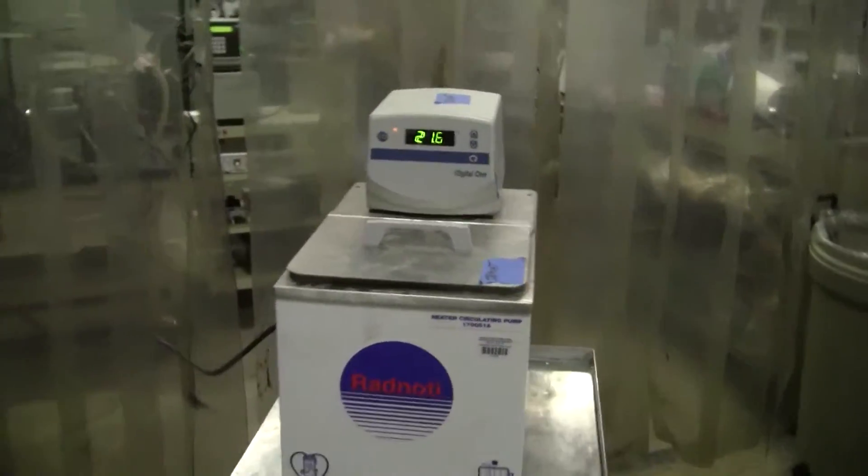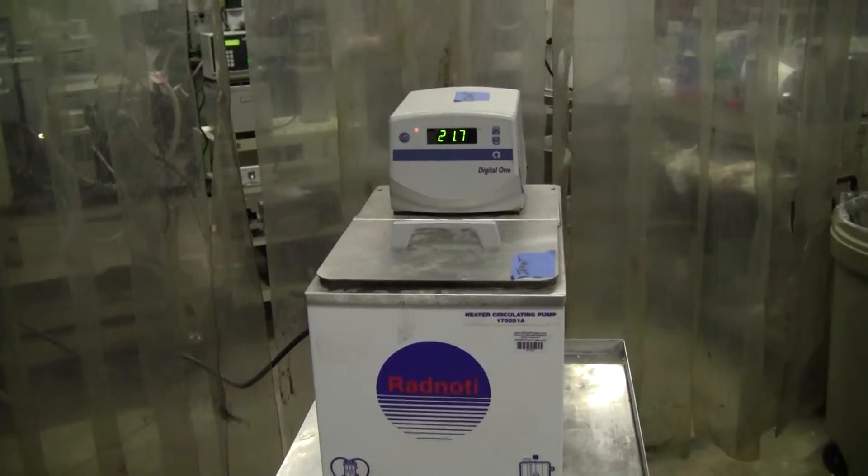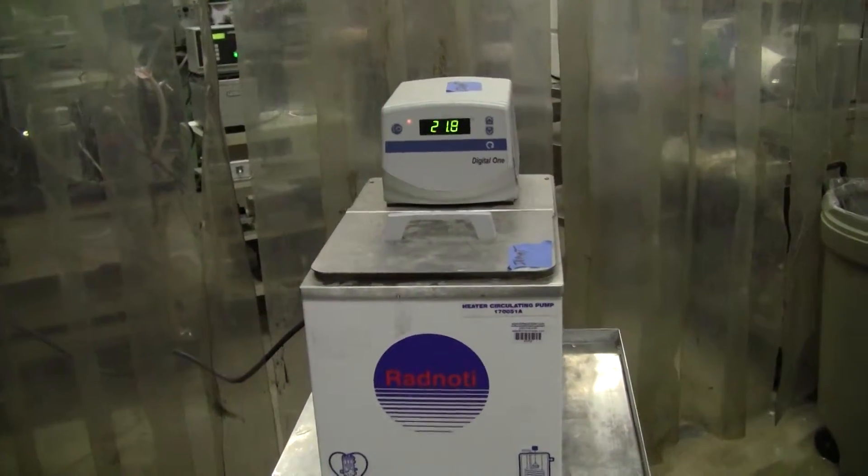Hi, this is Michael from High Tech Trader. Today we're looking at what I think is called the Radnoti Heater Bath.